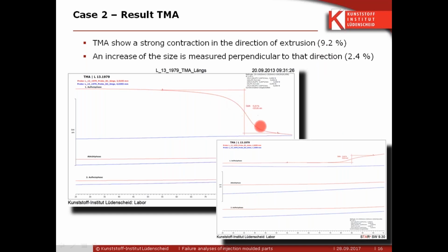Of course, yeah, thank you, Martin. Of course, at NETZSCH Analyzing and Testing, we like the last sentence very much. Periodic TMA measurements are recommended. However, you obviously see it's a small effect for a big effect in the end that obviously makes this part fail.